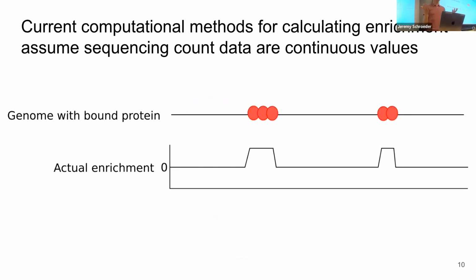By the way, those data I was showing you were not bad quality data. They're actually abnormally high quality. And yet the old way causes these issues with these dramatically negative, unrealistic spikes in the inferred enrichment values. So I've given you the intuition for what Enricherator can do with our data. And I want to now build in some intuition for how the old way actually gives us these unrealistic values that it does. So here's a separate toy example.